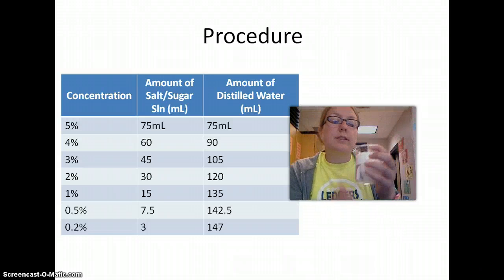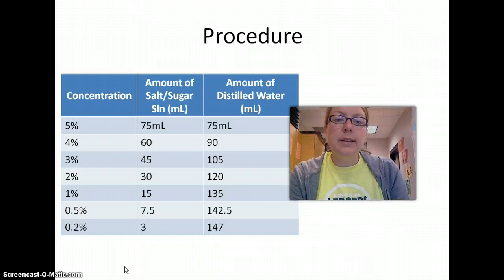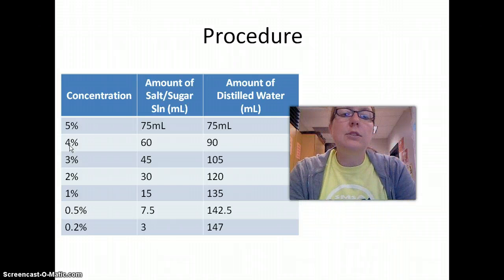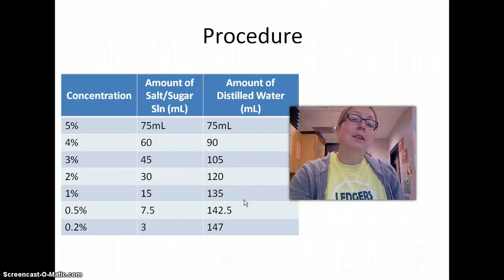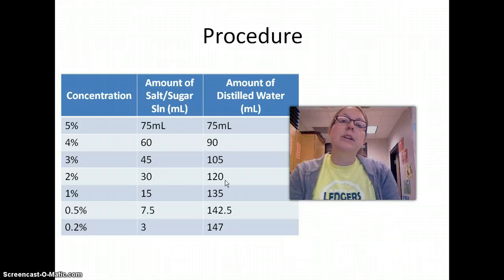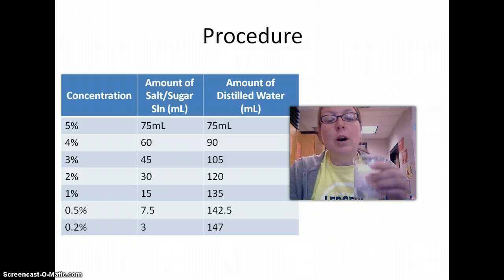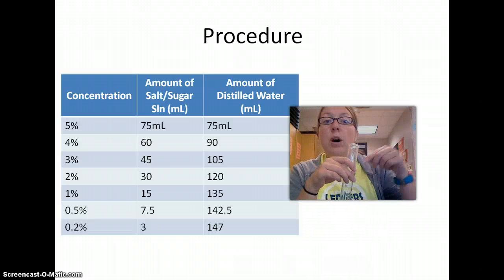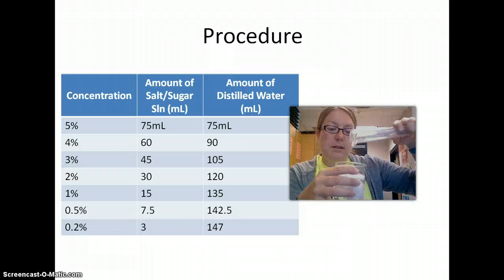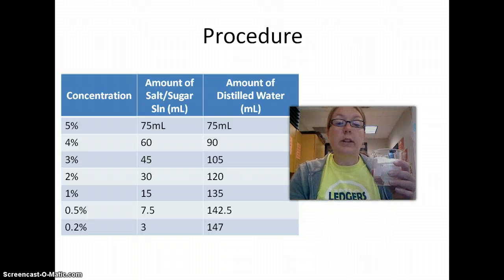So we're almost ready. Right now I do have a solution of acid in here — you guys won't, it'll just be the egg. Now you'll notice on this table that depending on the concentration of salt or sugar, you have different amounts of each solution and distilled water. But no matter what, everything always equals 150 milliliters. So you want to make sure at the end of the day you have 150 milliliters in your beaker. For me, that's easy — I'm just doing a straight control with distilled water, so I just take my graduated cylinder, fill it up to 150 milliliters with distilled water, pour it in my beaker with my egg, and I'm ready to go.